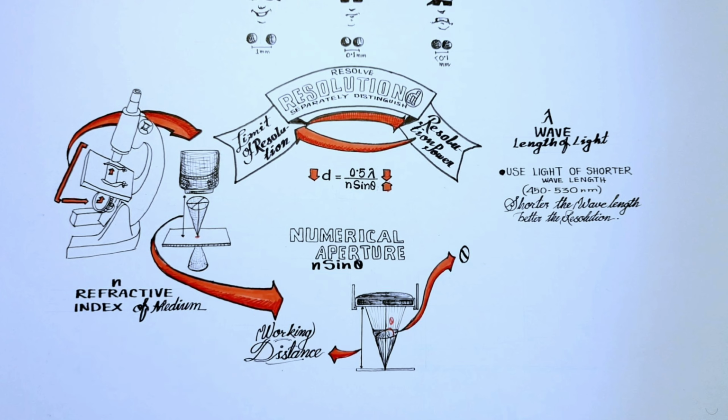Okay, let's get back to our goal of achieving higher resolving power by increasing the numerical aperture. We already know that the numerical aperture is the ability to gather light by the objective lens. So to enhance the ability of gathering light, we have to bring a bigger cone of light into the lens.